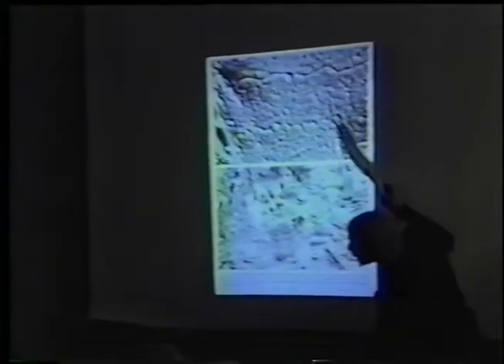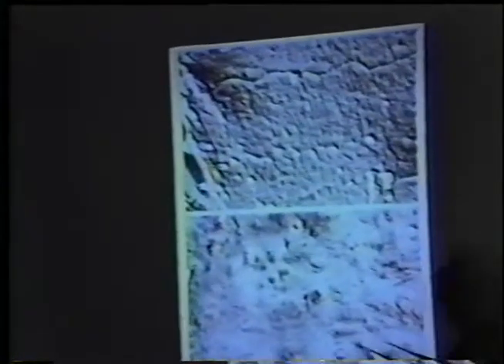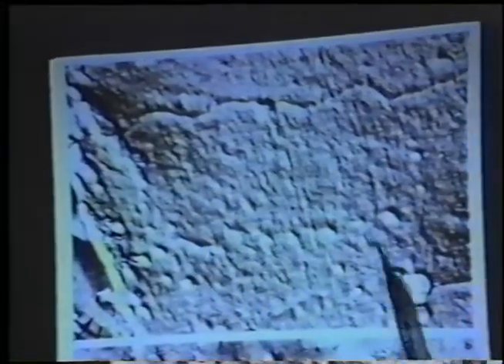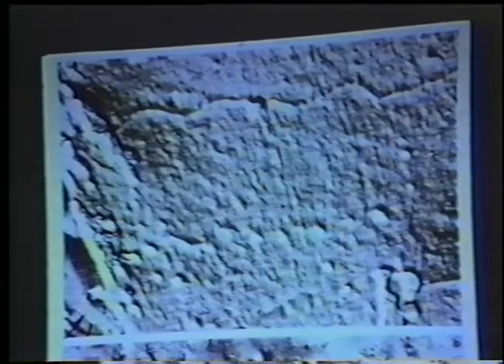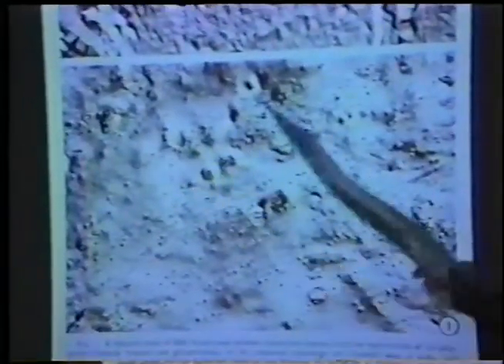This cell was not fixed and not pretreated. The freezing isn't great. You can see that there is virtually no evidence of fusion of vesicles with the plasma membrane. This cell was fixed with glutaraldehyde before it was frozen and fractured. And you can see there's fusion everywhere. It tends to occur in rows. It's not clear why. But this is one example of the kind of artifactual fusion that glutaraldehyde can cause.